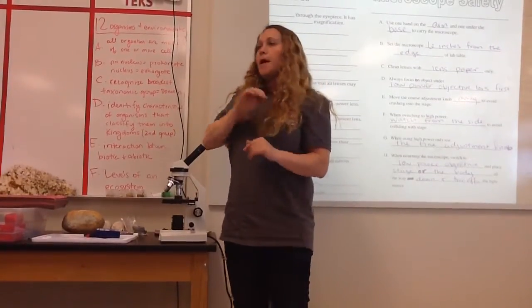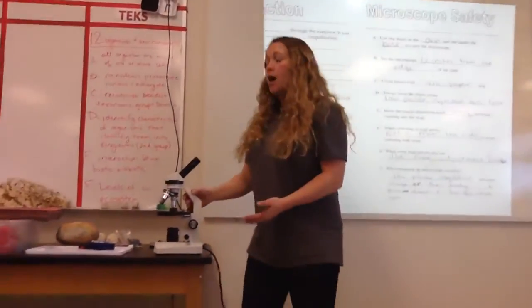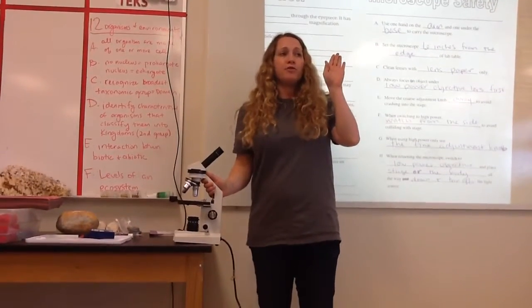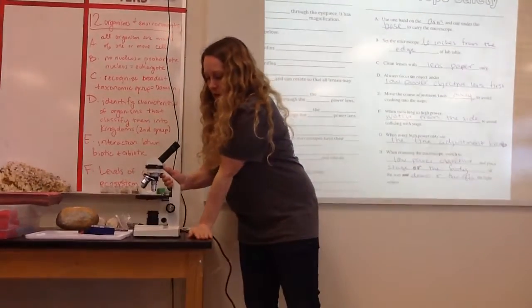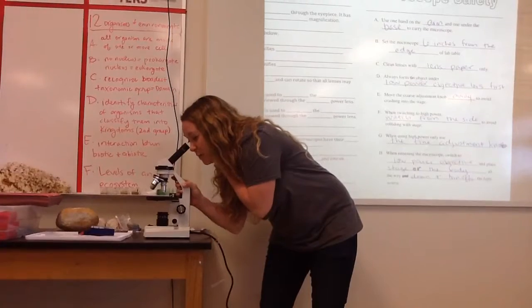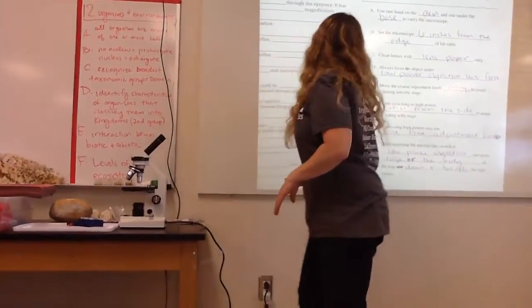All right, great job. All right, the second thing you need to know is set the microscope 6 inches from the edge of the lab table. So after you carry it and you come to the table, you want to look down. If you set it like this, you're putting it at risk, okay? So you want to make sure you can use your hand to measure 6 inches. It might not be perfect 6 inches, but it's just for safety. So a little bit in and a little bit in on the other side. While you're using it, you might be like, I can't see, it's too far away. So you can bring it close to yourself temporarily and then push it back for safety. Does that make sense, guys? Okay, so as usual, take care of any equipment in science, but this one's really important.